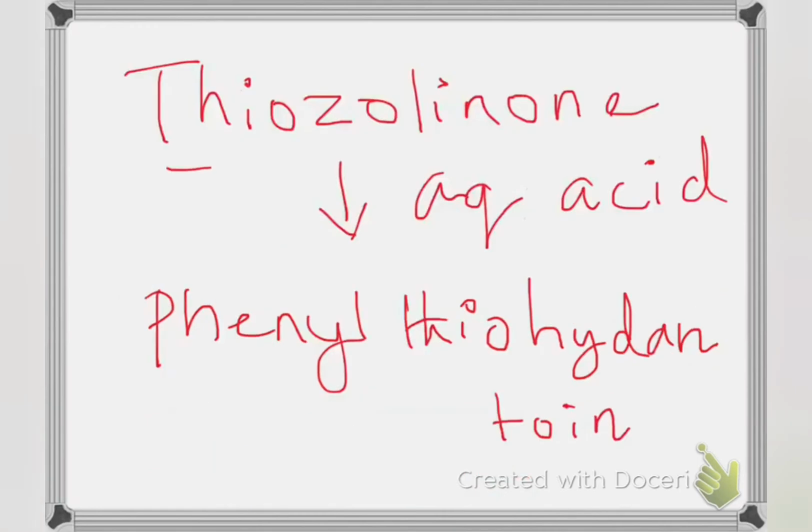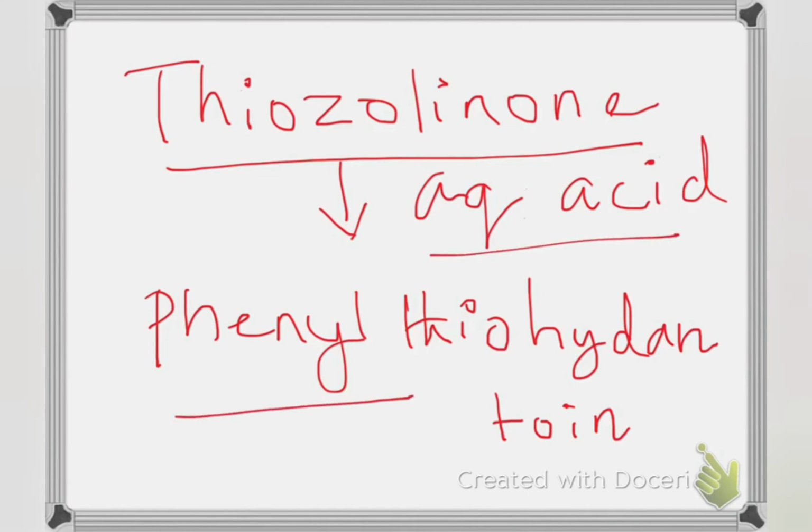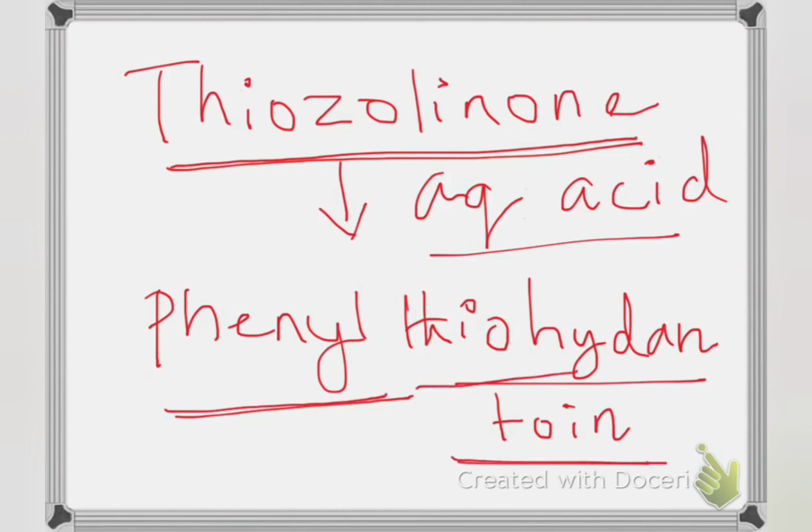This thiazolinone derivative is then extracted with organic solvents or aqueous acids, forming another compound, phenyl thiohydantoin amino acid derivative.